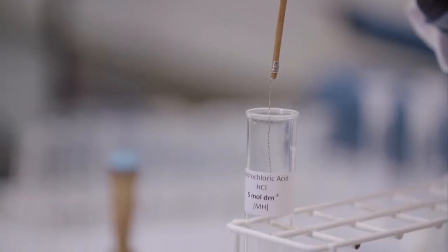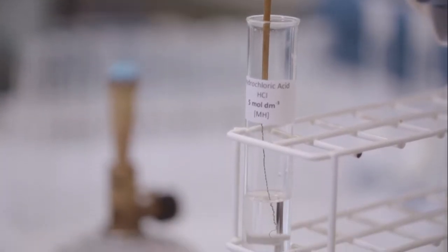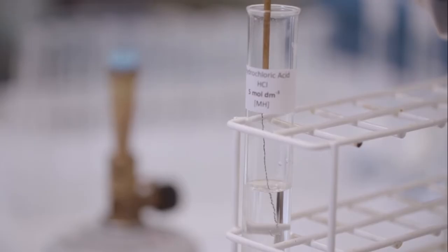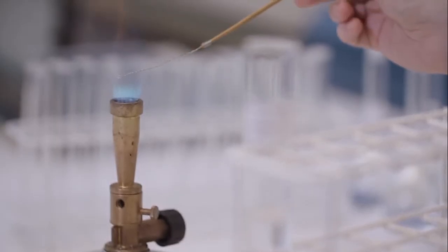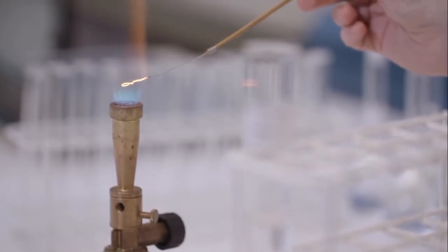In order to carry out the flame test, you need to have a clean flame test wire. To do this, dip the wire into concentrated acid and heat in the hottest part of the flame until no change in the flame colour is observed. You may need to do this a couple of times.